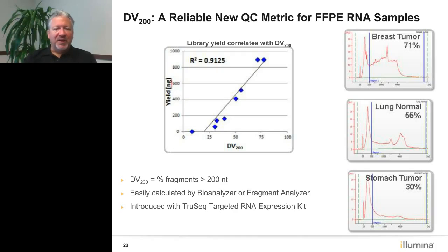The RIN number is the RNA integrity number that comes from the Agilent Bioanalyzer, reported automatically. It's really designed to calculate RNA that is less degraded than this, so closer to intact RNA than these RNAs. When you get down into this regime, the RIN number is really not appropriate.